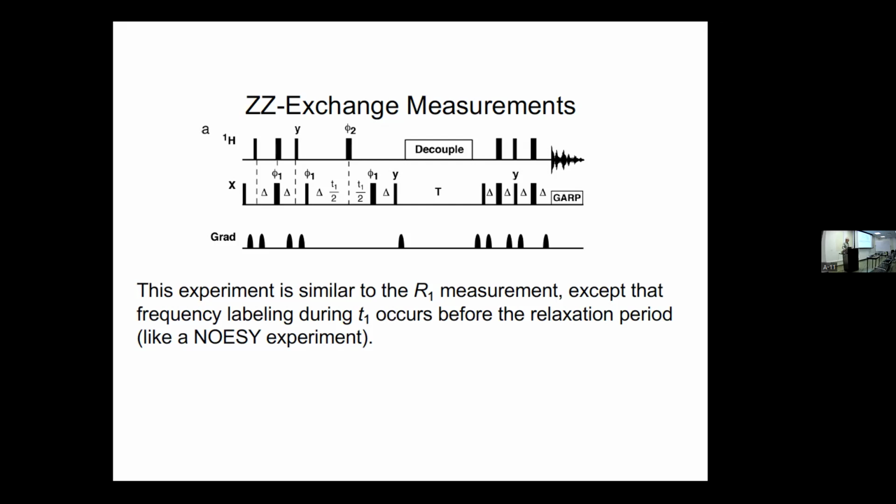And I think I might have said at some point that a ROESY spectrum has opposite sign, and that's why people do ROESYs to look for chemical exchange. But these days, because we can label, using a NOESY spectrum to quantify chemical exchange is difficult. Whereas if you can put nitrogen 15 in, then there's no NOESY peaks confusing things. There's only the exchange peaks. So this is essentially a NOESY for nitrogen 15.